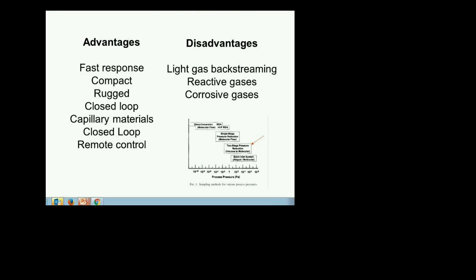Yeah, great. Okay, so typically we use our RGA for trying to troubleshoot chamber issues and eliminate contaminants and all that.